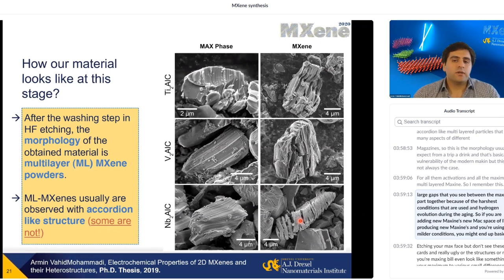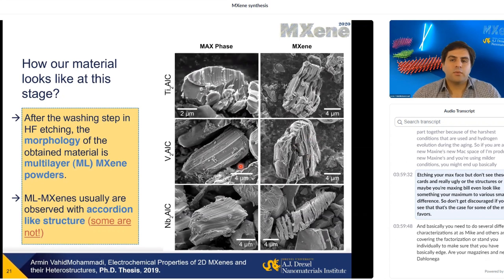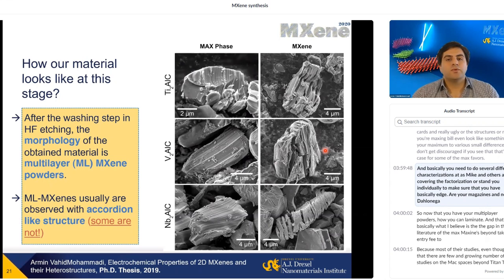So if you are etching new MXenes, producing new MXenes, and you're using milder conditions, you might end up basically etching your MXenes, but not see this accordion-like layered structure. Or maybe your MXene will even look like something very similar to the MAX phase, with a very small difference. So don't get discouraged if you see that. That's the case for some of the MXenes. And basically you need to do several different characterizations, as Mike and others will cover in their characterization course during the week, to make sure that you have basically etched your MXenes and removed the aluminum.